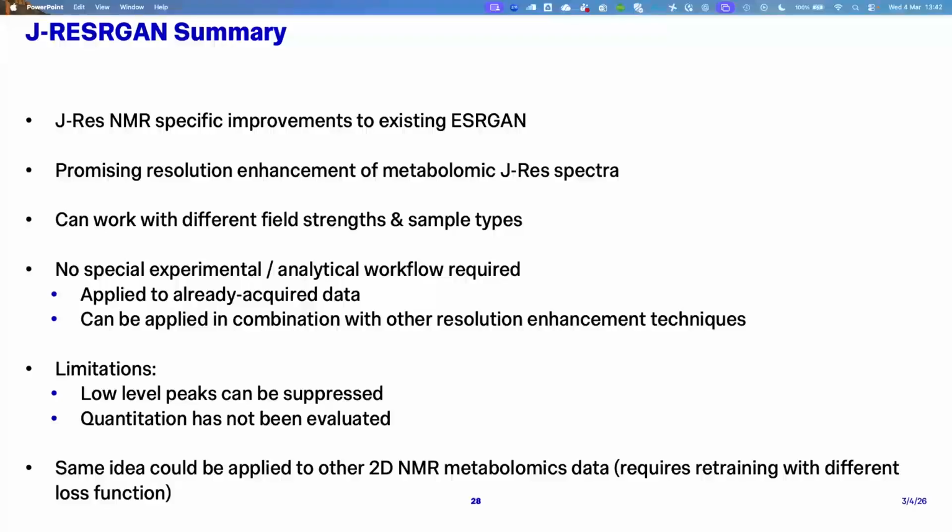At least in metabolomics, high field NMR, the signal to noise is not usually a big deal. Occasionally we want to look at very small things, but it can be in the future with benchtop instruments. People have tried in metabolomics a little bit to improve signal to noise via some of these approaches. It's become a little bit controversial because you end up essentially fitting a known peak function, implicitly or explicitly, and then you almost say that there's no noise left because I fit this thing. So what you're really doing to the signal to noise is a bit more tricky.